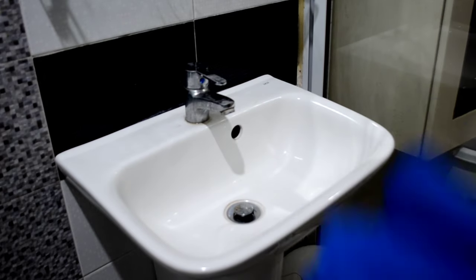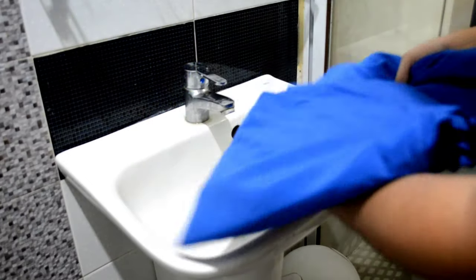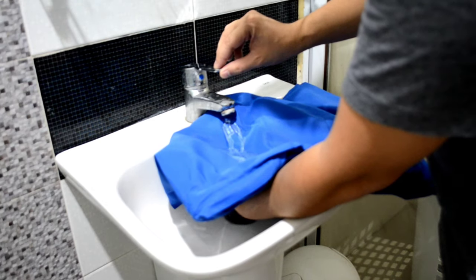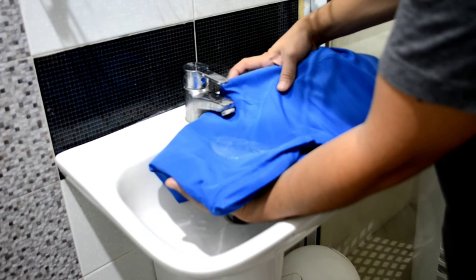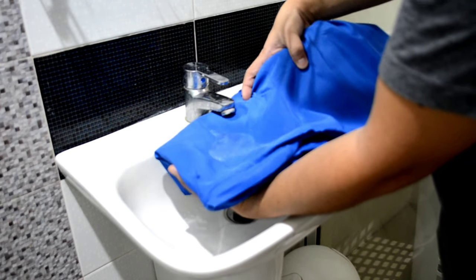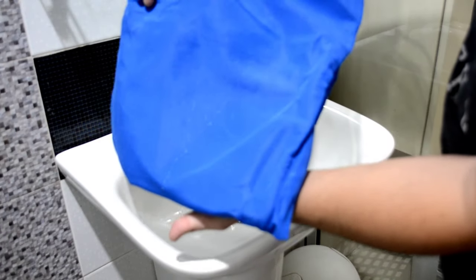This is how you check and test your coverall. Kunin niyo yung coverall nyo, and then sa faucet — hindi naman siya ganun kalakasa — paagusing yung water dun sa coverall, and then check niyo if parang nagsasway yung water. You can also check the back part kung nababasa siya or kung tumatago siya — kasi kung tumatago siya, syempre hindi siya water repellent. Pero with this material, talagang water repellent siya — nagsisway yung water, tapos hindi talaga siya nababasa or na-absorb ng coverall yung water. Same thing with the Gouash — the Gouash PPE is also water repellent.